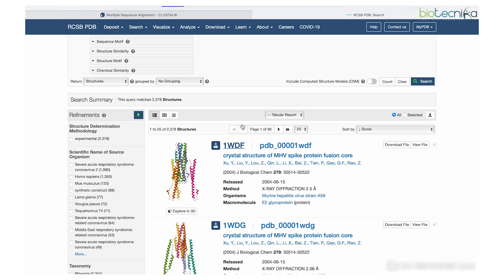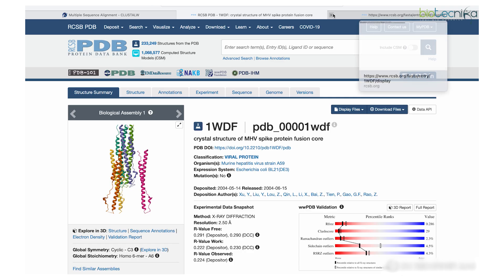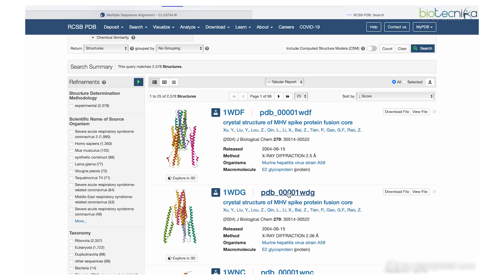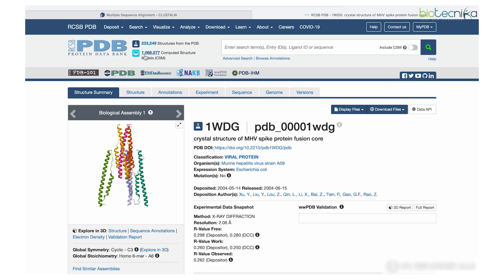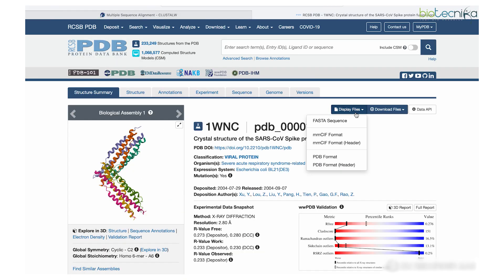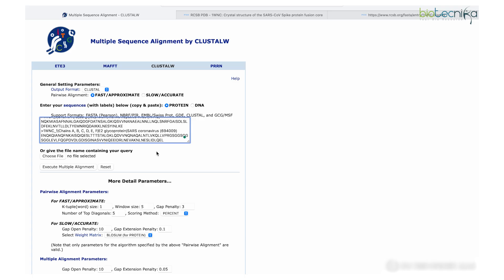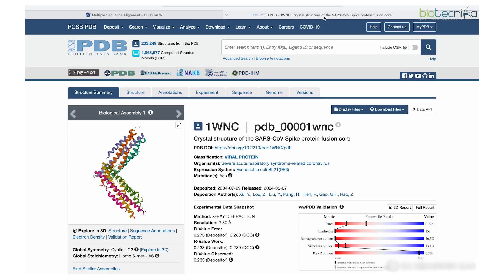I'll take two or three randomly. For the first one, go to display files and you'll get the FASTA sequence — simply copy it with Ctrl+C and paste it into ClustalW. The first sequence starts with the FASTA header sign. For the second sequence, the next one has very few minute changes so I'll take the third one instead — which is from SARS-CoV-2. Copy it and paste it in as the second sequence.